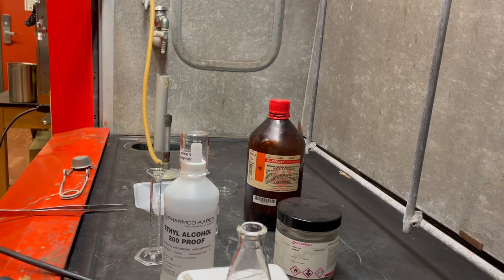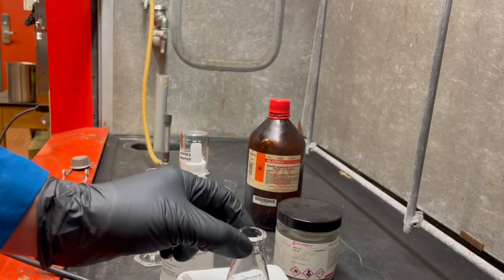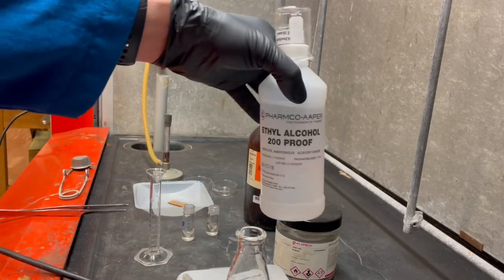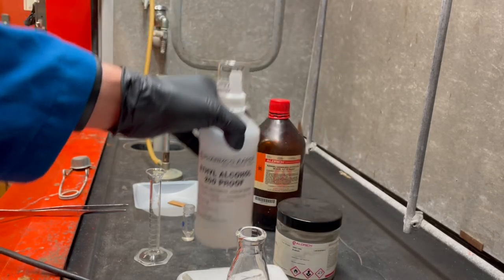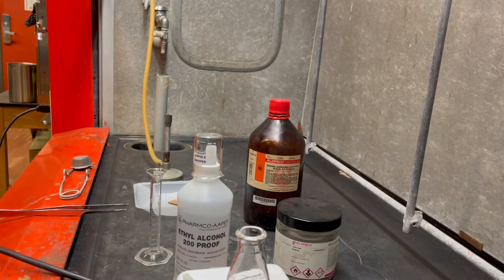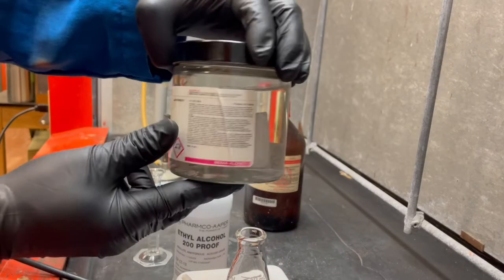Because what I'm going to do after that is add 10 mils of absolute ethanol. So here's our ethyl alcohol, 200 proof, right? 100%. At least no water, right? As we learned from our last experiment. And once I add that ethanol in there, I'm going to add some cut up pieces of elemental sodium.